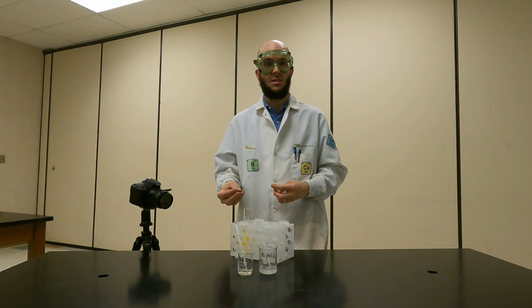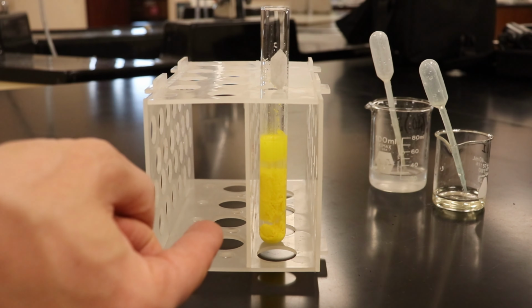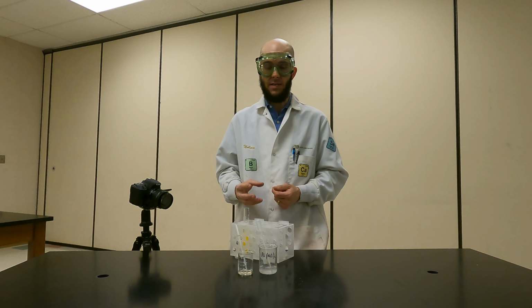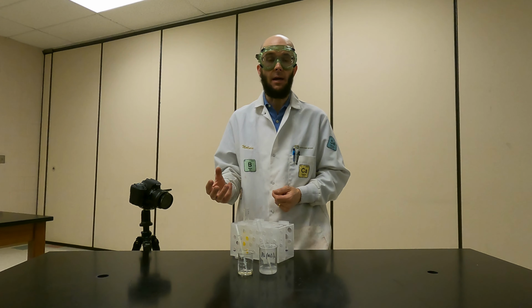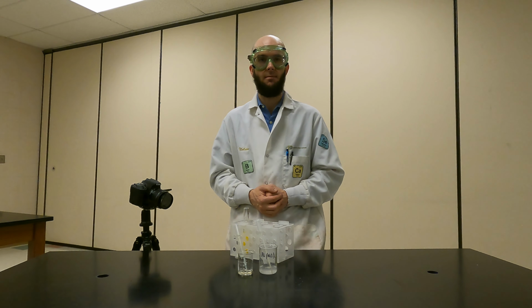So this yellow stuff is solid. This is lead iodide. Now the potassium nitrate is in there. We just can't really see it. It's just dissolved in the solution still. Often we'll see solids as precipitates. Sometimes we'll see the formation of water, as in an acid-base reaction. Sometimes we'll even see the evolution of gas. So that's our double replacement reaction.